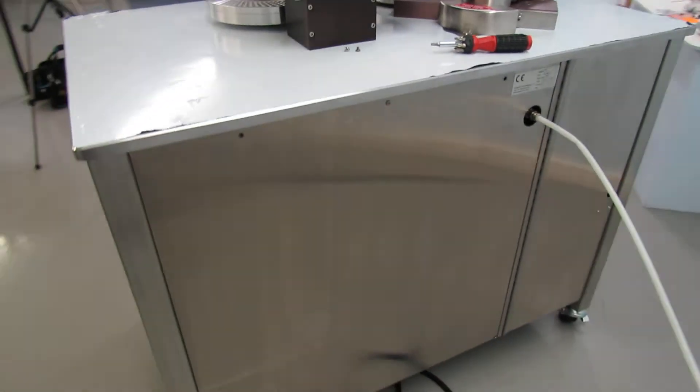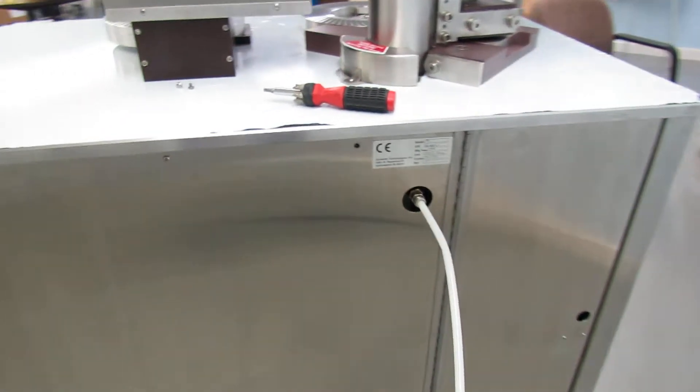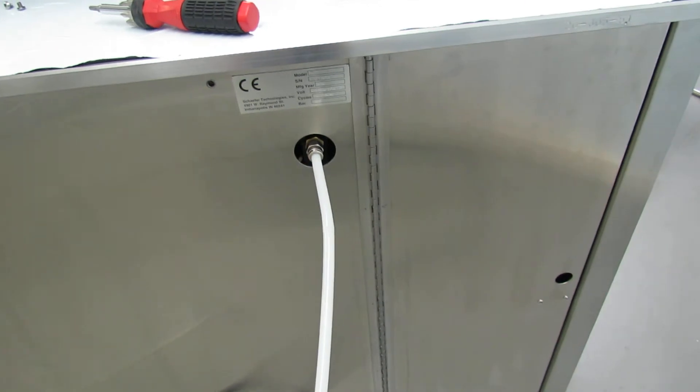And here you have fully enclosed with the compressed air supply.